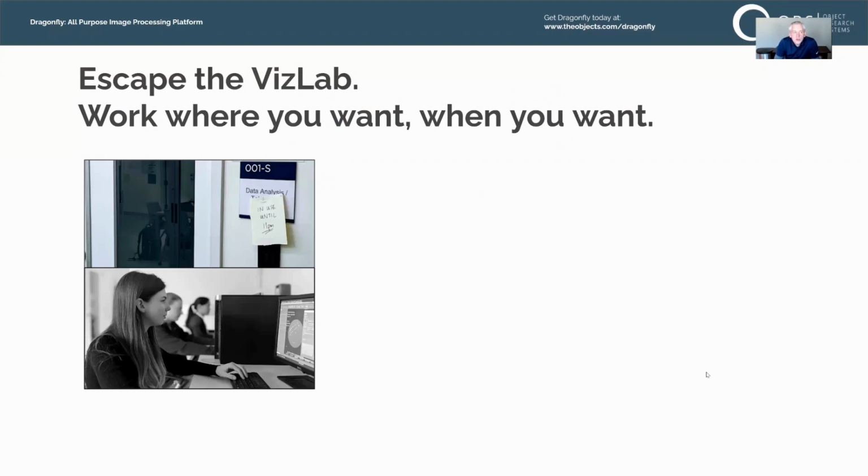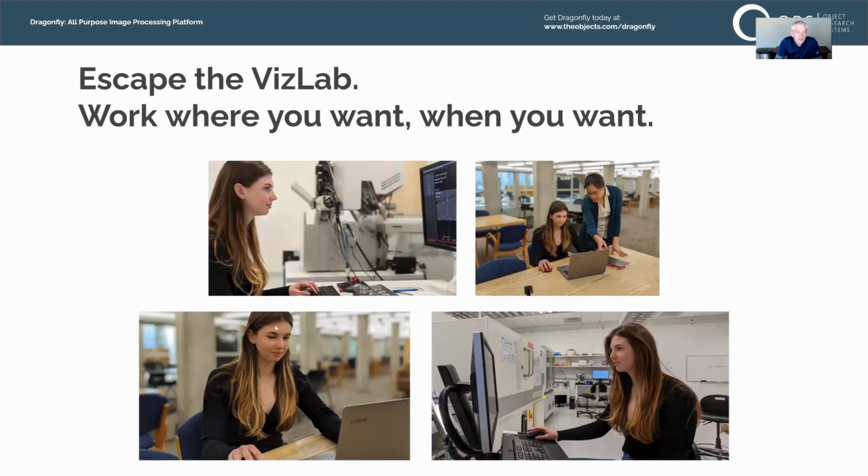So we want you to escape the VizLab. We don't want you to be chained to those workstations in the basement. We want Dragonfly to meet you where you are. We want you to work where you want, when you want. So let's leave the VizLab behind and let's take Dragonfly where you are.